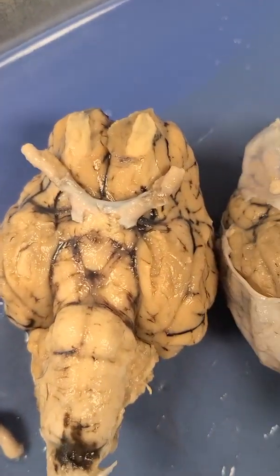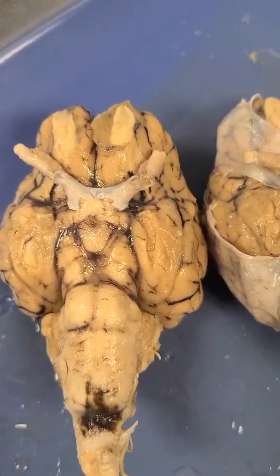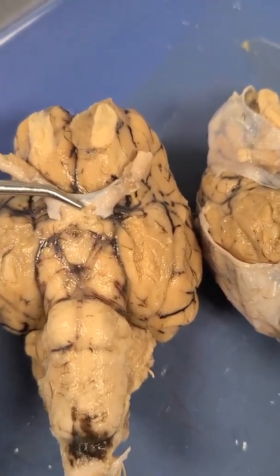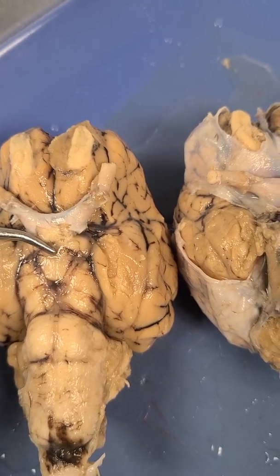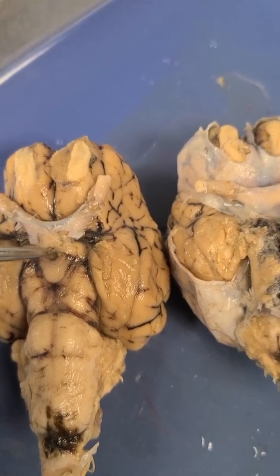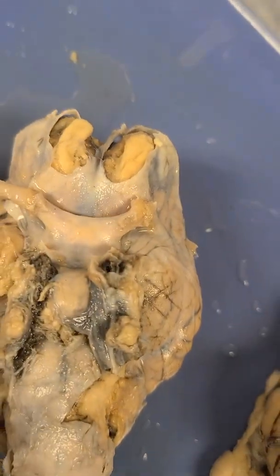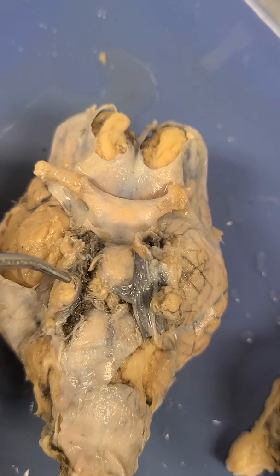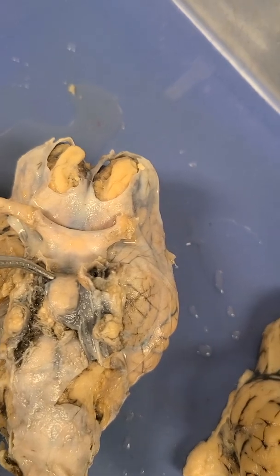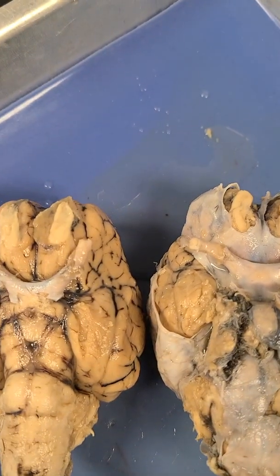In this brain where the meninges has been removed, I asked you to identify the infundibulum, and it's really not even the infundibulum. It is the hole that the infundibulum was attached to. So if you find the optic chiasm and go from here, there's this little hole right here, and this is where the infundibulum, a stalk, was attached. And attached to that infundibulum is the pituitary gland. Over here, this is all still attached, and here is the actual pituitary gland, attached by a stalk to the infundibulum. But when we take off the meninges, all of this comes off.